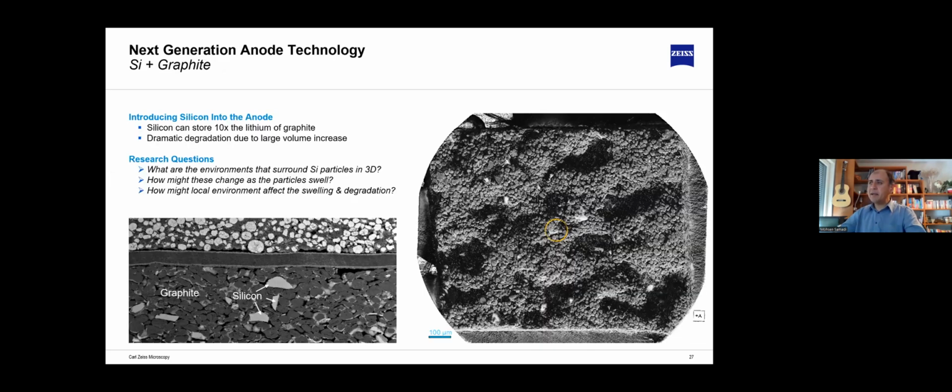So as an example here, we are staying with silicon plus graphite anodes. A bit of background on why this material: energy materials are a focus today. Silicon particles are known to increase the capacity of batteries extremely. However, their dilation effect is, or let's say, they deteriorate quite quickly due to cycling of the battery.